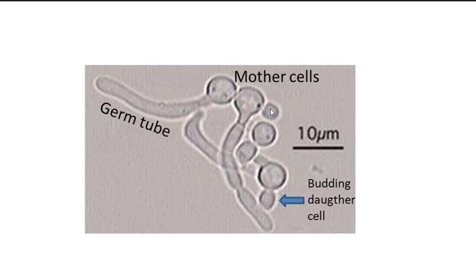Okay, this is not a germ tube. This is not a germ tube. These are all budding yeast. This is a germ tube.